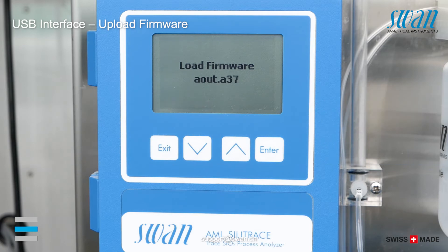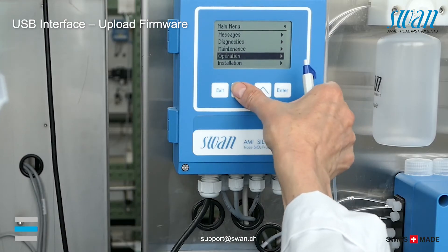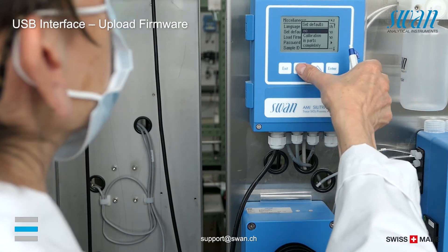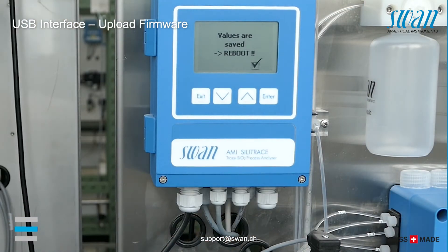After the upload has been finished, the instrument reboots automatically. It is mandatory to perform a complete reset to default values after a firmware upgrade.